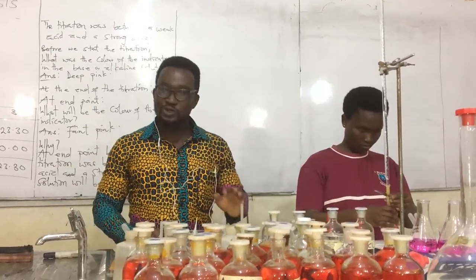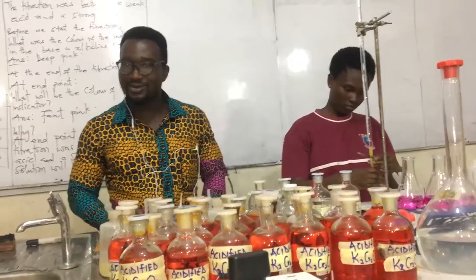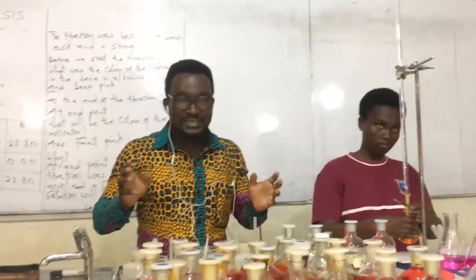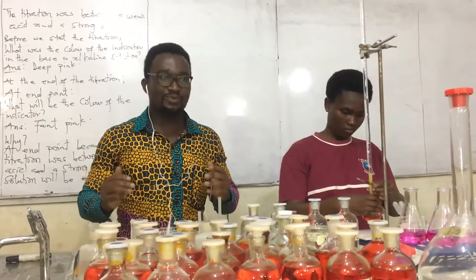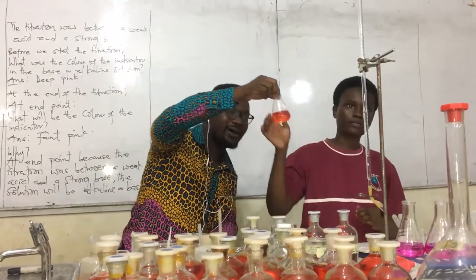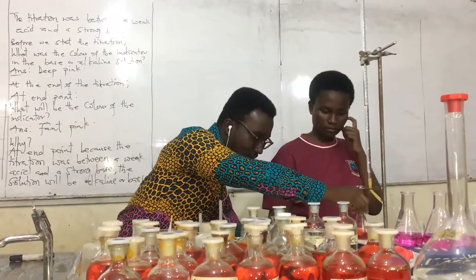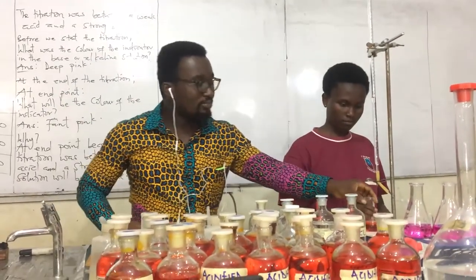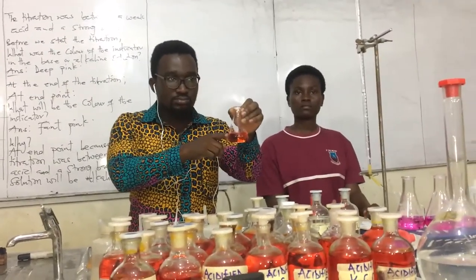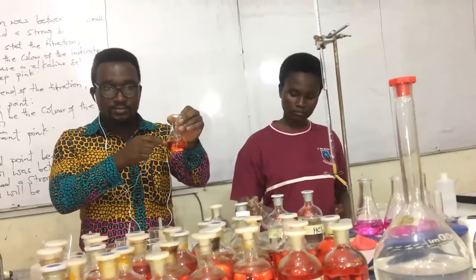We are supposed to go by the books. It's supposed to be orange, not pink, and not red. Red and pink are inaccurate. You want precision, you want a precise color. So, nicely, a single drop of this volume will end up in red, which means we have passed the endpoint.